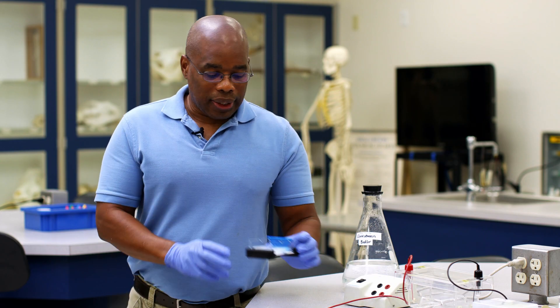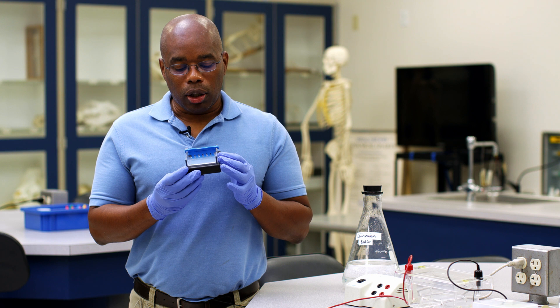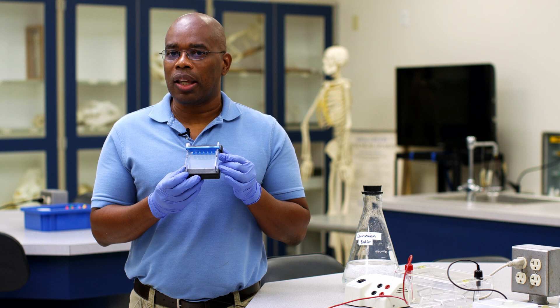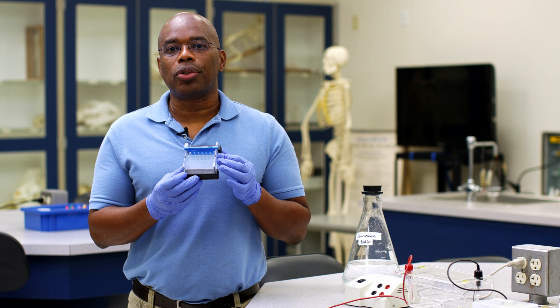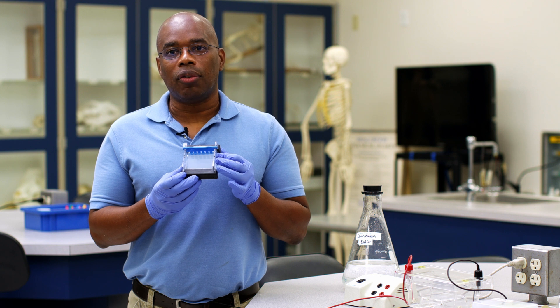The first thing we're going to look at is this thing called a gel, and this is where we get the term gel electrophoresis from. 'Gel' because this is a gelatin-like substance we're going to use as basically a molecular sieve, and 'electrophoresis' because we're going to expose our samples to an electric current in order to separate the different pieces of DNA.